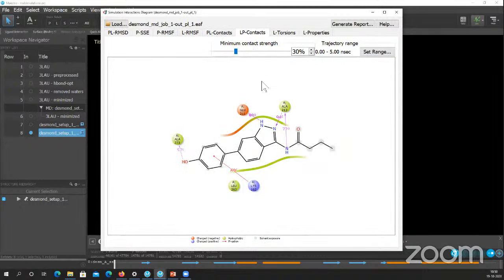If you have looked at the ligand interaction diagram that we looked at during docking analysis, it's the same image here, where you have the ligand and the protein amino acids that are forming the interaction with the ligand. And you can see the type of interaction, whether it's a hydrogen bond donor or a hydrogen bond acceptor, which is similar to what you saw for docking.